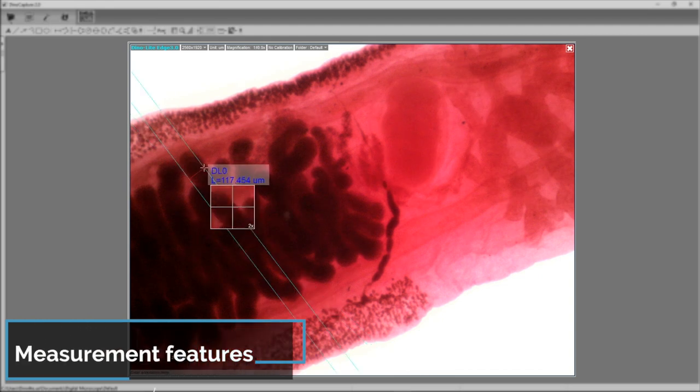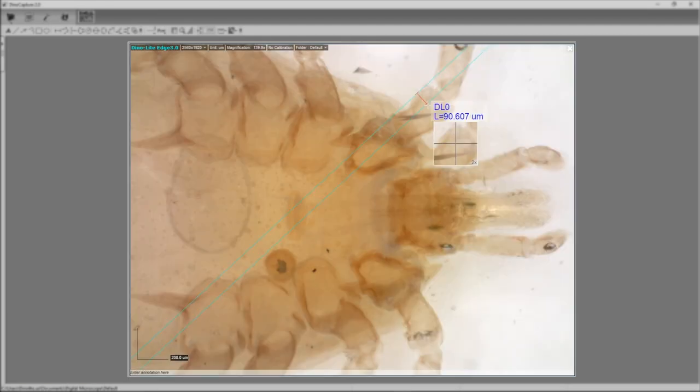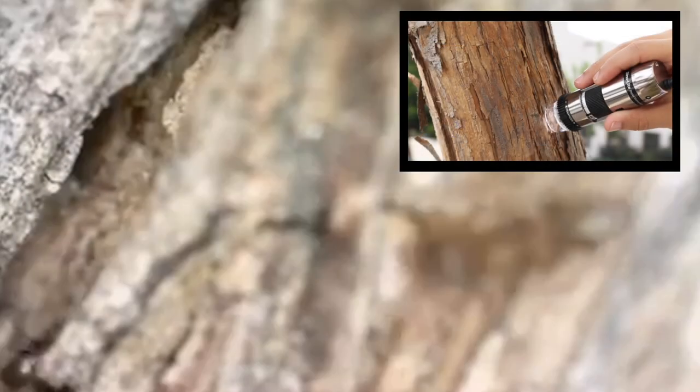The Dynolite includes feature-rich computer software that allows for live viewing, image and video capture, measurement, and other advanced features for compatible models on supported platforms.